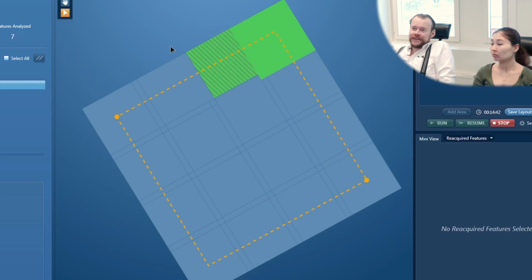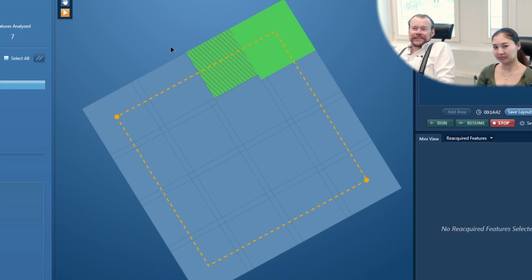So if you want to scan large areas, you need to have optimized the system. I mean, you cannot scan for hours on each image. No. So you need to have something that goes pretty fast.